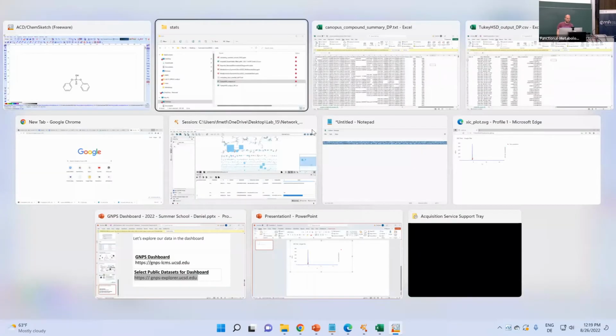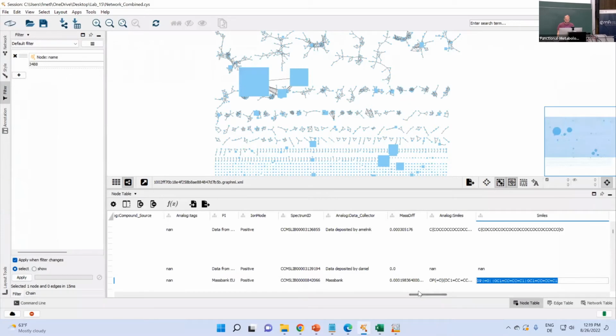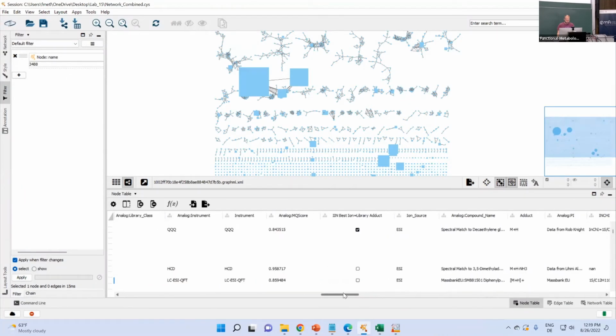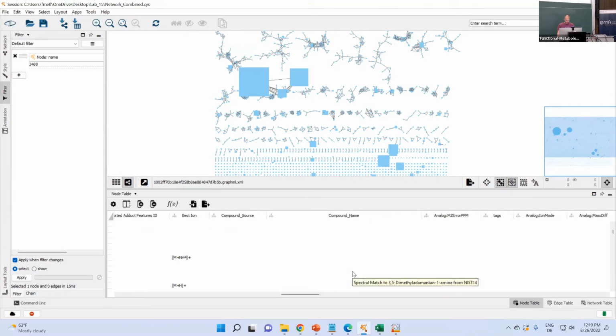All right, so let's go back to the network. And let's go farther down. And see, now we're already really deep down, right? So if I would have looked at the top 50 features, I probably would not have seen anything with a library hit that could be interesting.